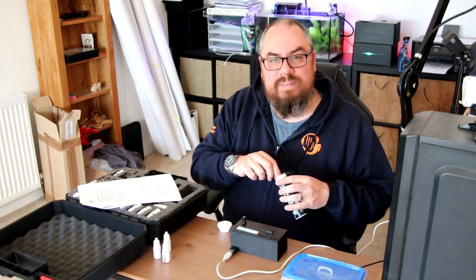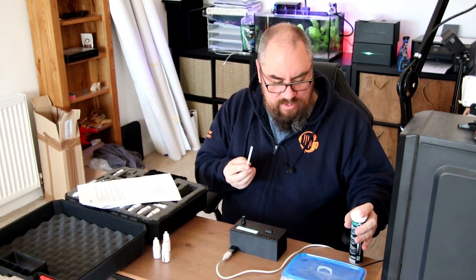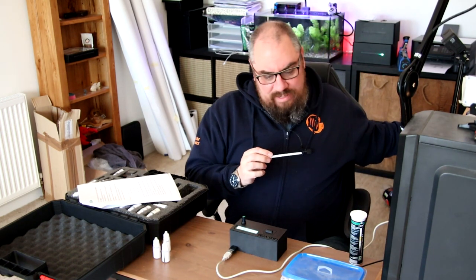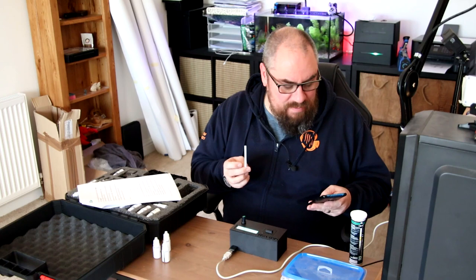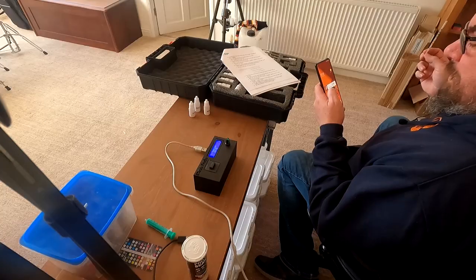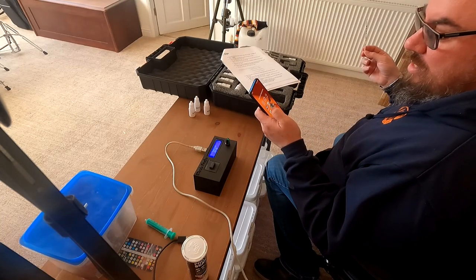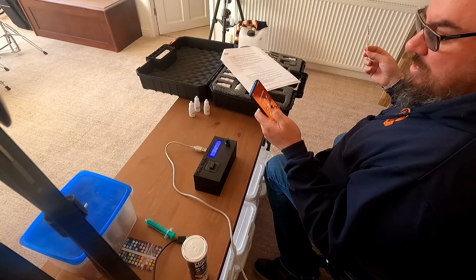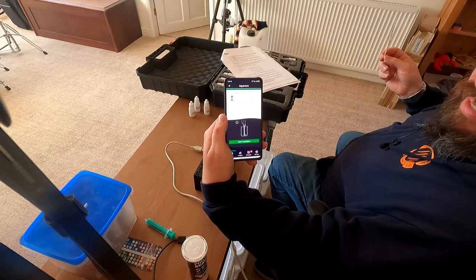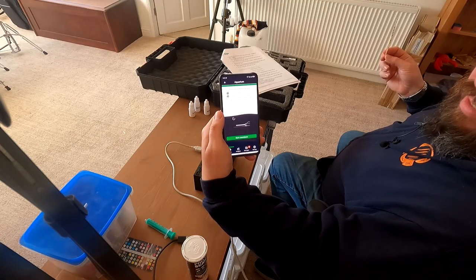While we're waiting for that, we'll go back to my standard tests — this is definitely the quickest way to do it. We'll test with a test strip and with the API kit, and compare all three results. With the JBL kit, all you do is open the app on your phone — JBL Pro Scan. The app tells you what to do: start the countdown, dip it in, shake it off, and compare results.